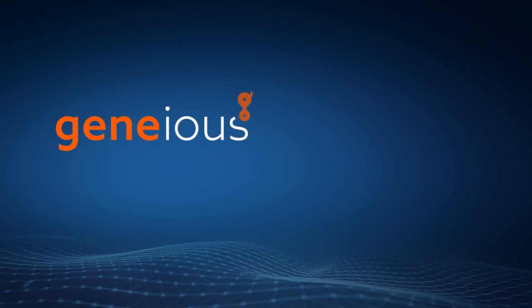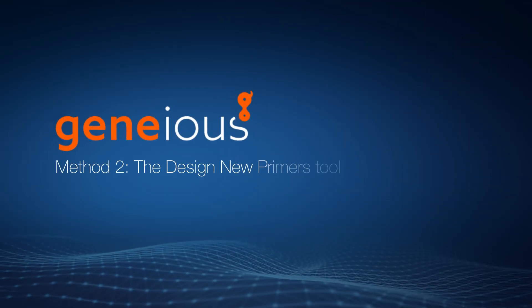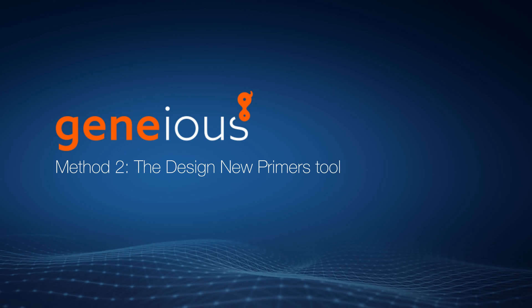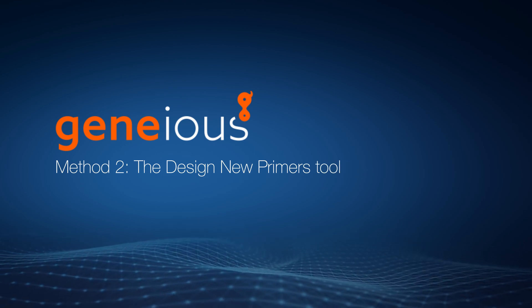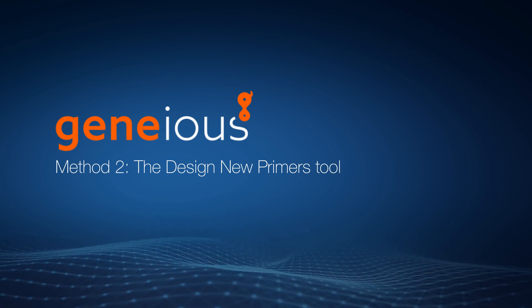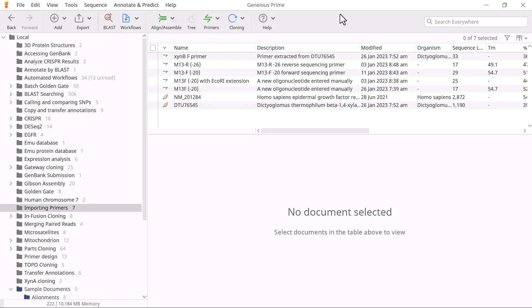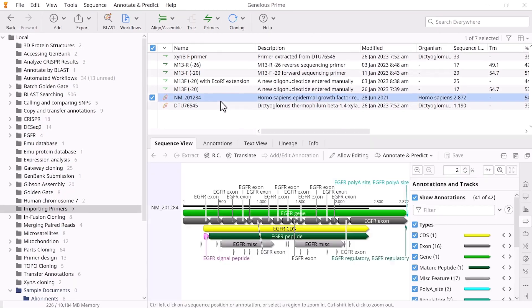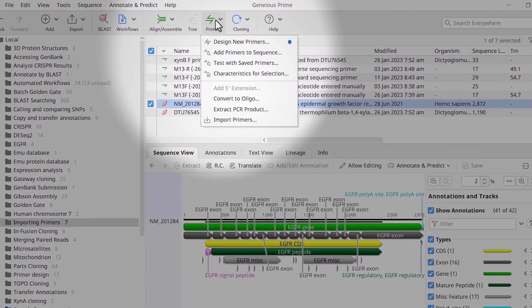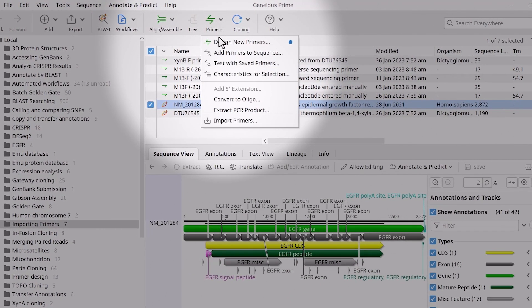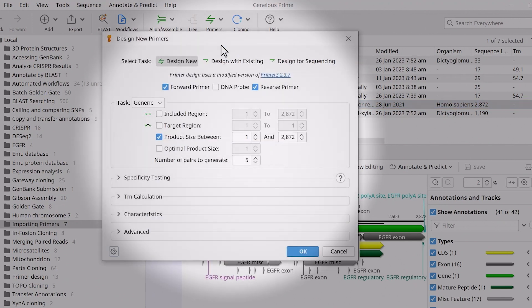Another way you can add five prime extensions to primers is via the Design New Primers tool. With your sequence selected, go to Primers, Design New Primers. In the new window, adjust the desired primer settings.